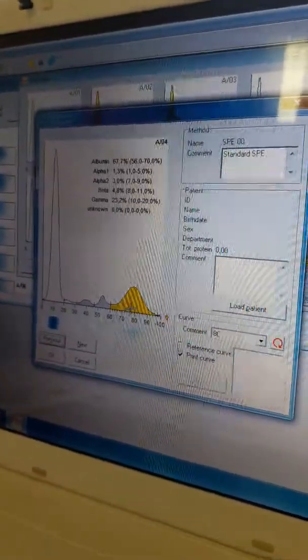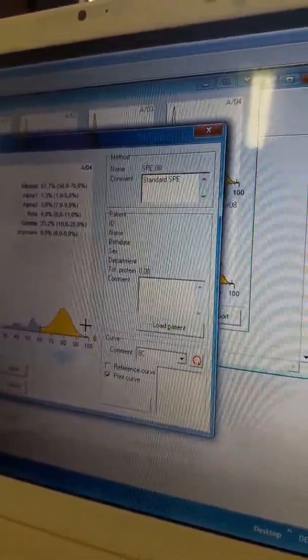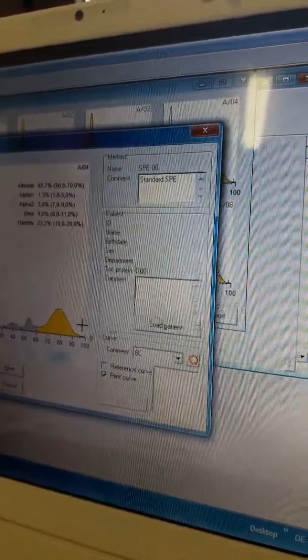Or this one, there is one additional there. Place the vertical line on top of the minimum marking you want to delete, double click with left and it disappears immediately.